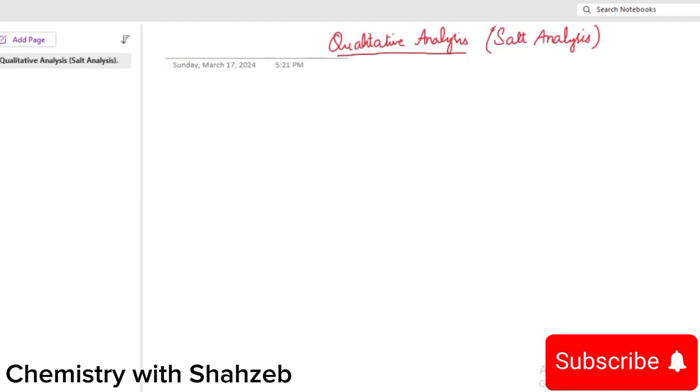So basically, in salt analysis, we are going to discuss that a salt is composed of a cation and an anion. For example, if it is copper sulfate, then copper is a cation and sulfate is an anion. Sulfate is a polyatomic ion, which is made by the combination of two or more nonmetals. So let's start with the cations test.